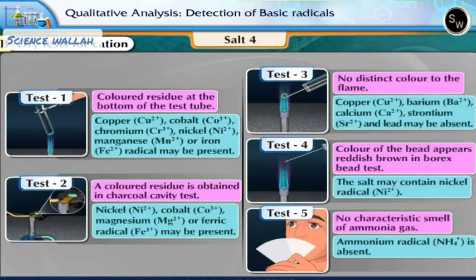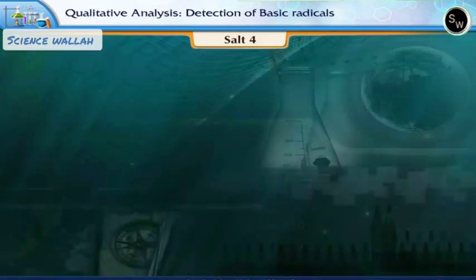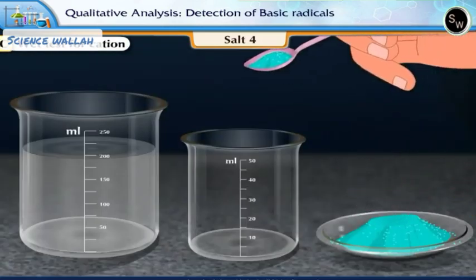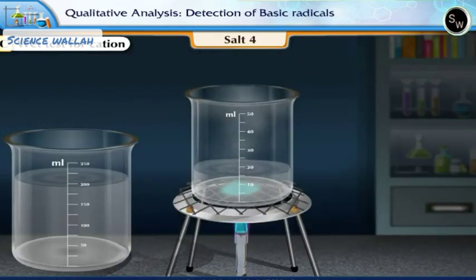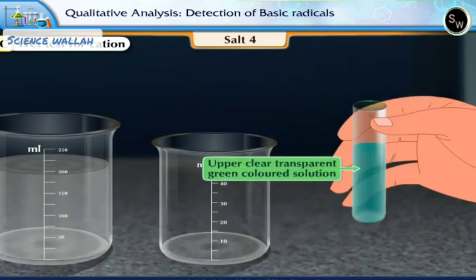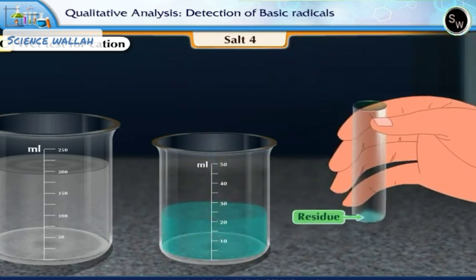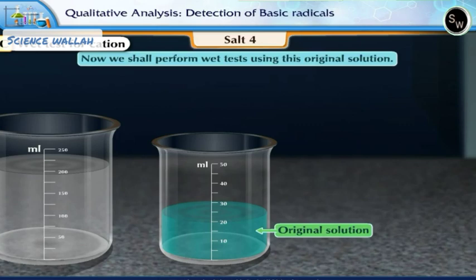After performing the dry test, we conclude that the probable radical present in the salt is nickel. Now we shall prepare the original solution of the salt to perform the wet test. Take a pinch of the salt in a small beaker. Add about 1.5 test tubes of water and boil it. The compound does not dissolve completely. Transfer this solution in a clean test tube and centrifuge it. Transfer the upper clear transparent green colored solution in a clean beaker, discard the residue settled at the bottom. This is called the original solution. Now we shall perform the wet test using this original solution.